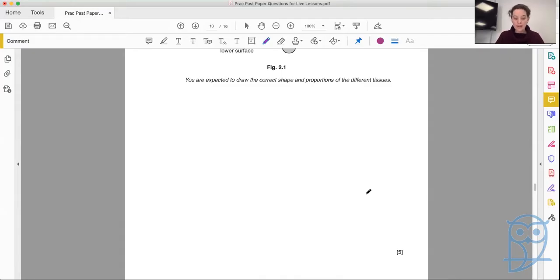So if we work with that image from the textbook, we would end up with something like, the top also dense on this one. Remember, you always draw what you see. We've got a very thin epidermal layer at the top. Okay, you would be doing this in your very sharp pencil. Okay, we don't draw an end off here because it carries on. So we let it carry on the sides.